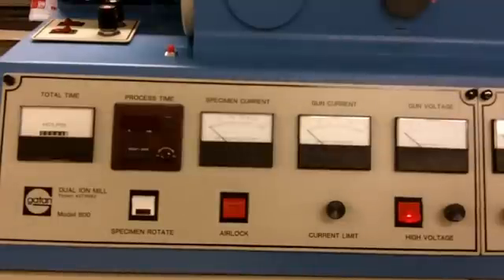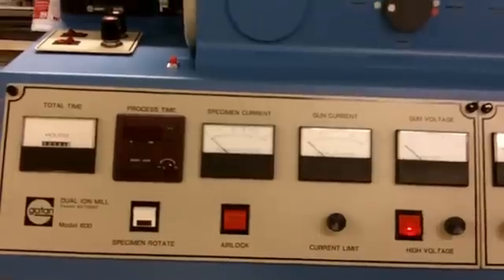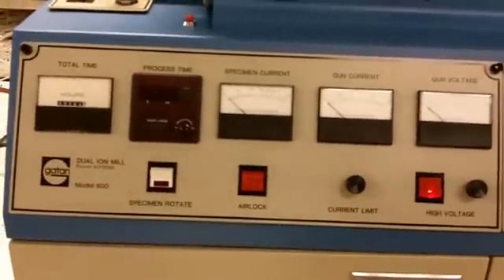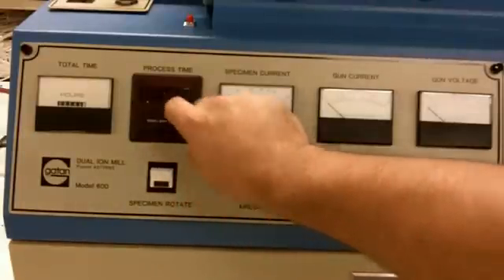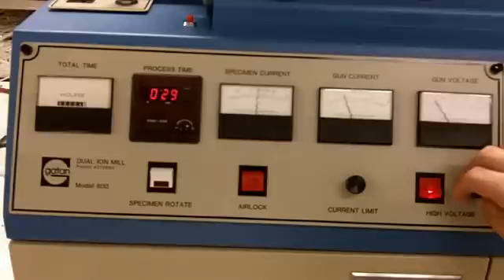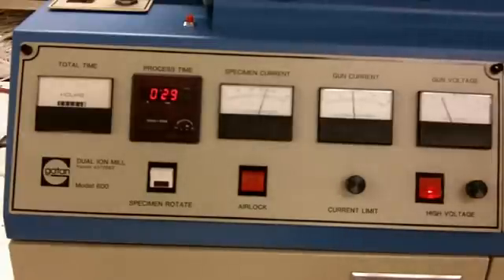Now that our system on the left side has been pumped down, I've set the gun selector to white and turned on my gas. We're going to proceed with ion milling on the left side. Set the gun current around one milliamp. On this side, the white gun is the top one, and you can see it emitting an ionized stream in the direction of the sample holder. Now we're looking at the red gun, which on this side is the bottom. As you can see, it's emitting an ionized stream in the direction of the sample holder.